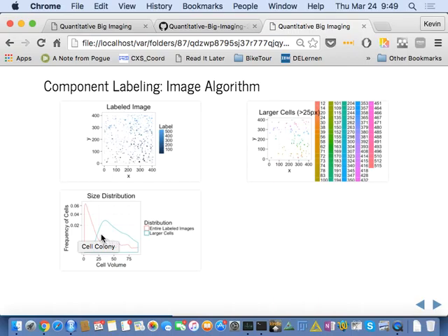And this is actually a very helpful criteria for defining what's a cell and what's not a cell. And so now we can see, there's a pretty large distribution between 0 and 75, maybe square micrometers. And if we exclude the points below 25, that gets rid of a lot of the dust. And so rather than trying to filter this image better, we can simply take the component labeling and say all these really tiny objects we want to completely ignore. And so by doing this, it gives us the ability to get rid of those objects, so we can just show the larger objects and keep those.